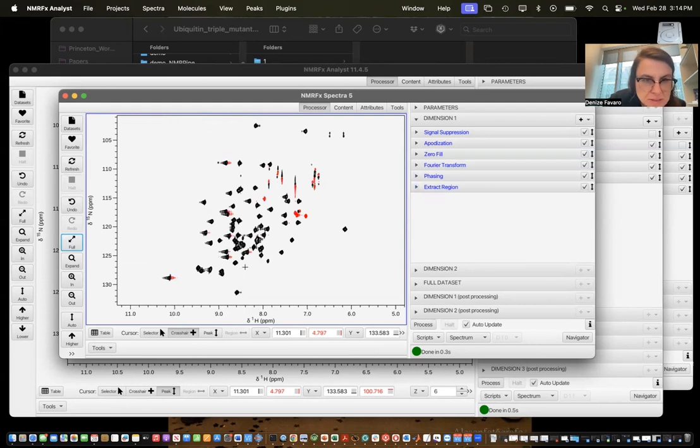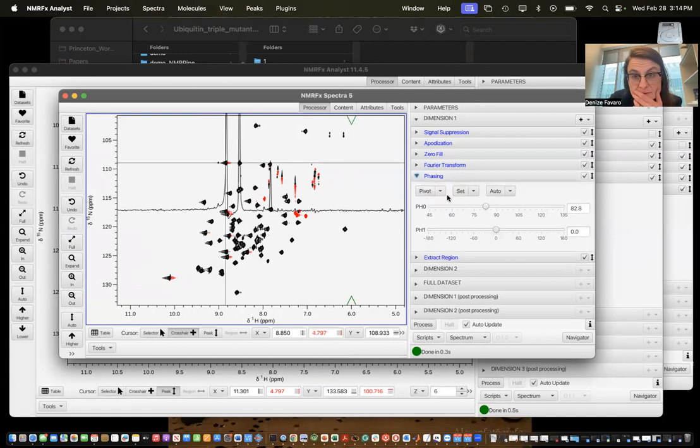Cool. And then, okay, so it's not so great, my phasing, so let me try to get a bit better. Yeah, I see that I'm having some issues with my stronger peaks here.